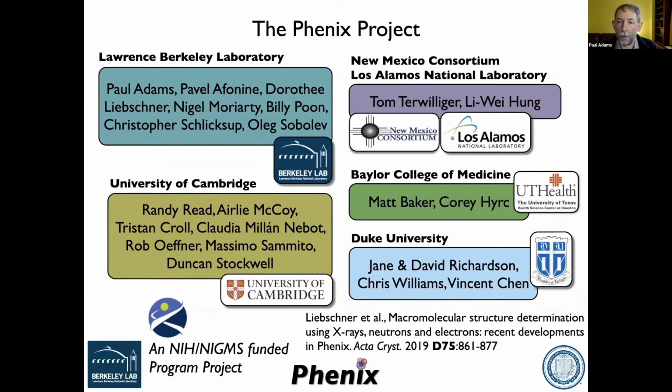Sure. A follow-up of that. So are there some red flags for the map to model FSC that you must be looking out for? Let's begin with that, and then I would like to come to the cross correlation values, if there are any.